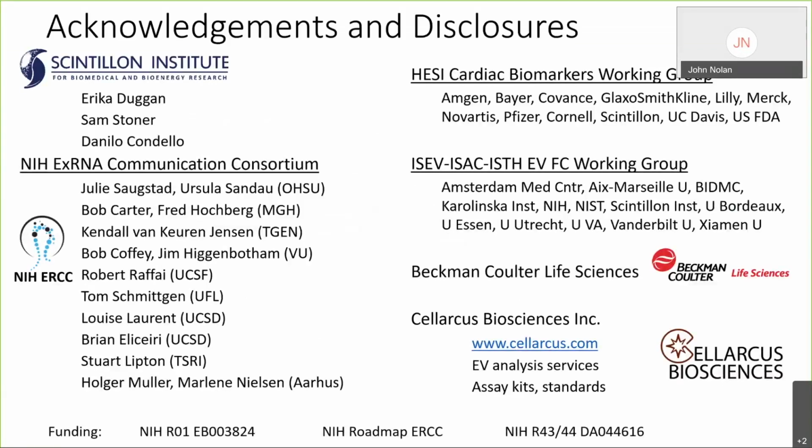So as Joanne mentioned, I have a lab at the Scintillon Institute in San Diego. We develop technologies, flow cytometry mostly, instrumentation, reagents, assays. We do a lot of our biology by collaboration, including with the ERCC group, Extracellular RNA Communication Consortium from NIH.